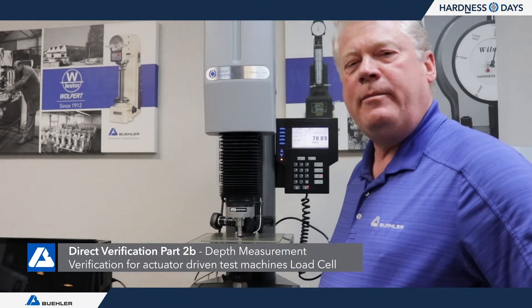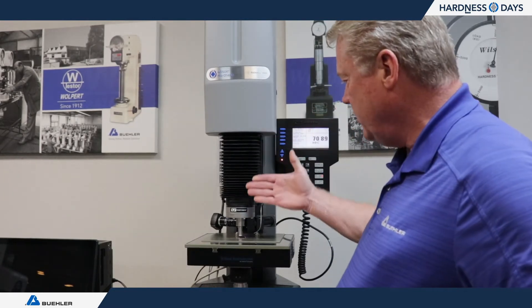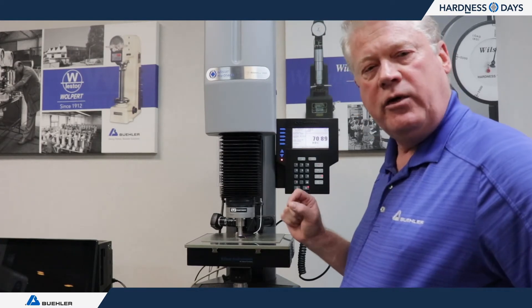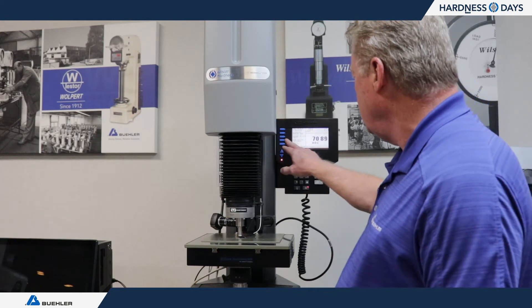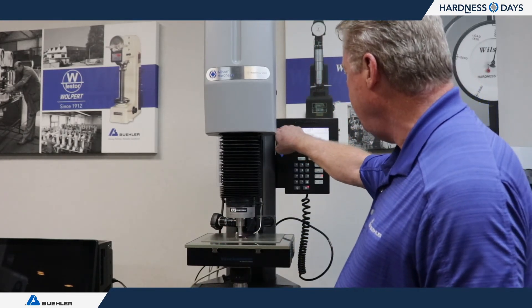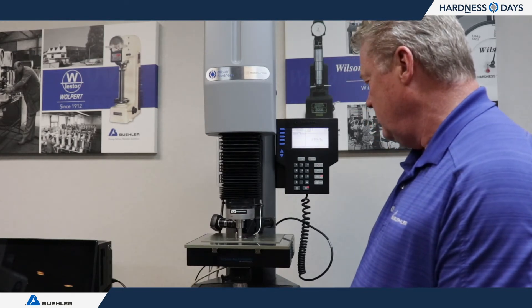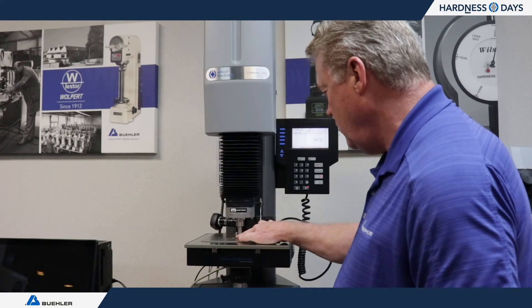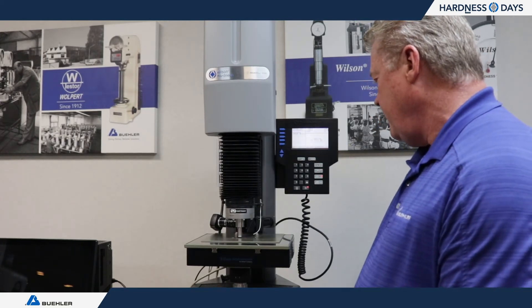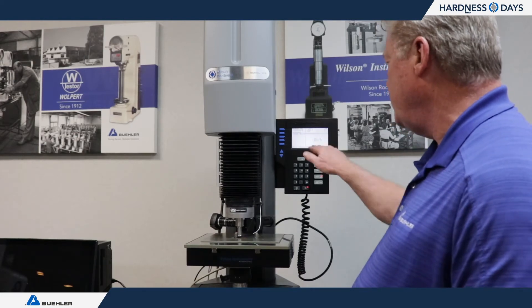On the RB2000, we measure depth calibration using a slightly different technique with calibrated gauge blocks, because the actuator is what moves on this machine rather than the part. We use software in the machine to measure the differences between two gauge blocks. I go into the gauge block test method, line up the first gauge block with a blunt indenter, and click Establish Reference — it goes down, touches the surface, and records a zero value. Then I change to a 1.05 millimeter gauge block — a difference of 50 microns — and tell it to measure that block. It contacts the surface and reads exactly 50 microns.